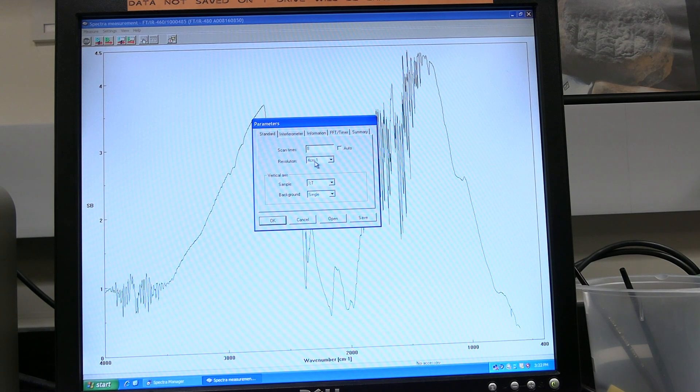For samples, set how to collect the sample data. Leave background set to single. Click on the interferometer tab. Set gain, scan speed, and filter to auto. Click on the information tab.